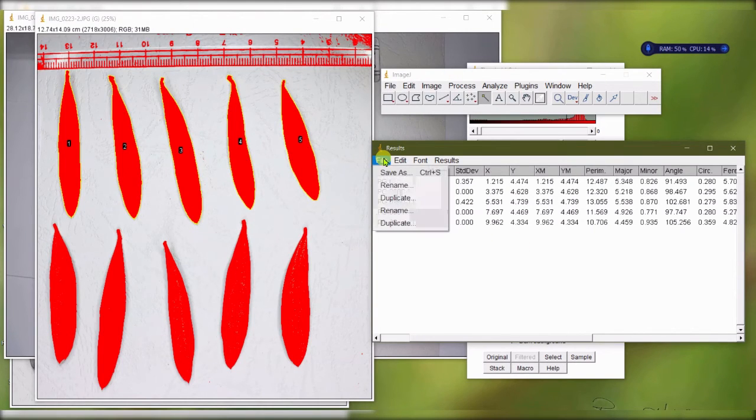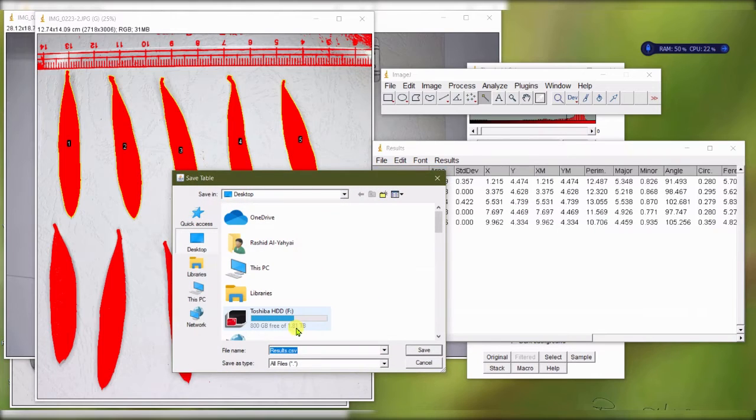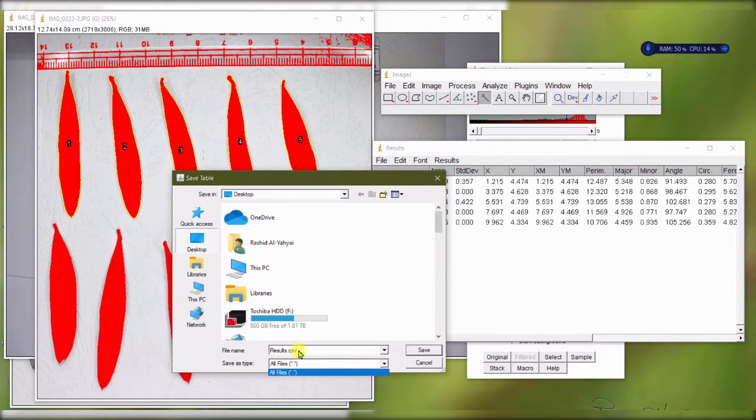Then you can basically save this file as CSV and open it in Excel if you are interested.